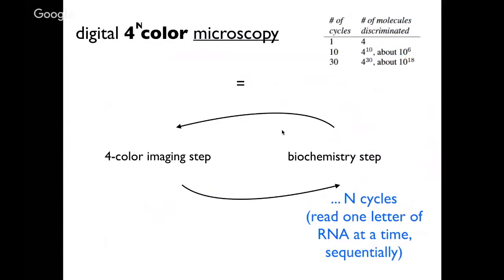So as Tony mentioned, a way that we can try to put all these things together is by doing the sequencing of barcodes, and as I'll mention, also potentially of other molecules that are present in the sample in addition to the barcodes, doing this sequencing of those as an imaging approach.